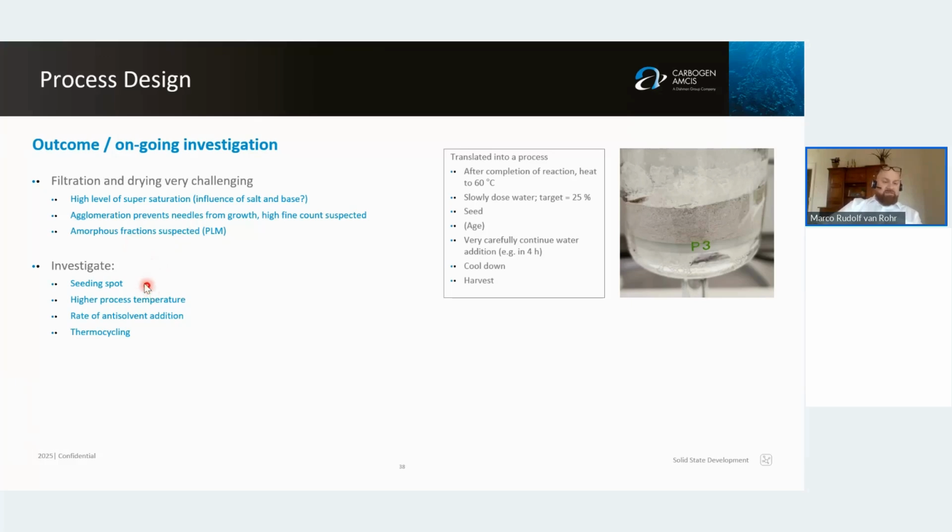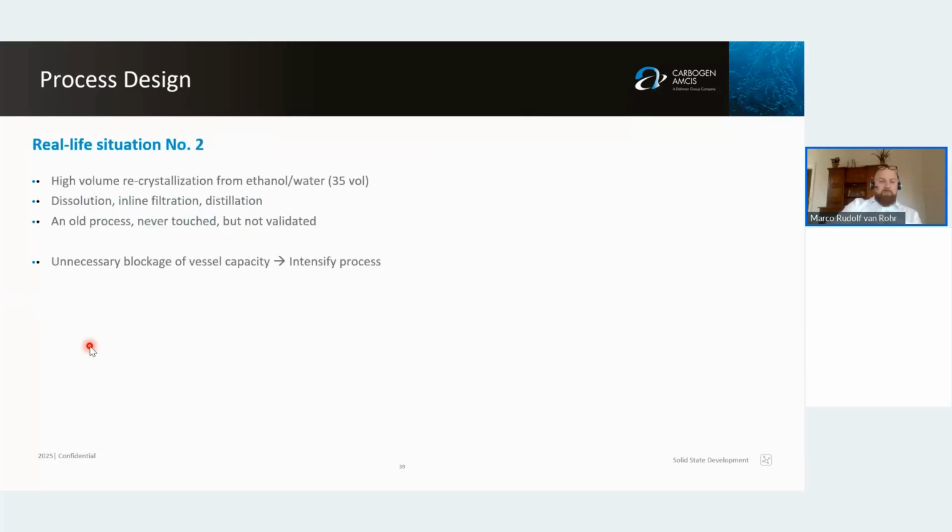Next steps for us is to investigate the seeding point. We'll go back with the amount of water added, a higher process temperature, potentially checking the rate of anti-solvent addition, and also we will investigate whether thermocycling is an option or not.